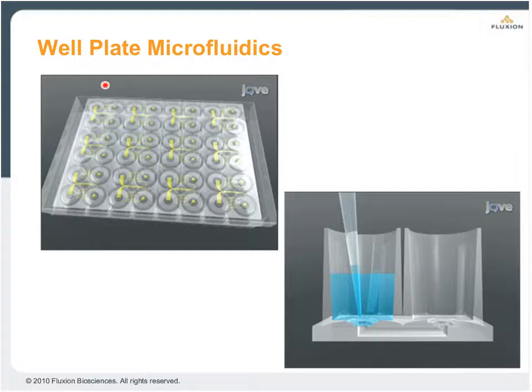All the channels run from well to well, and they're all independent units or independent experiments. The channels are then repeated over the entire footprint of the well plate, giving you several experiments per plate. In this case, there's 24 shown.